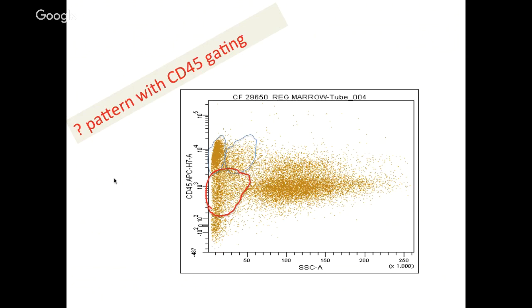They come here: cancer cells, normal myeloblasts, cancer myeloblasts, hematogones, they all come here in the red window gate, the blast gate. You can call it blast gate, or this is better termed as progenitor area. And below the progenitors could be debris, where you can have some RBCs, red cells, platelets.